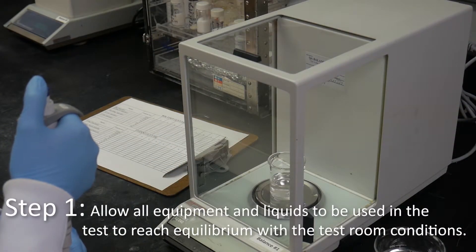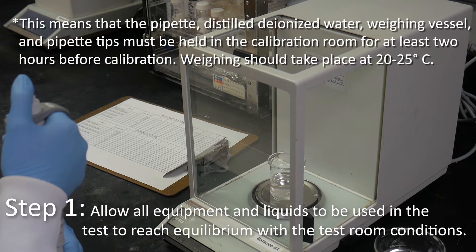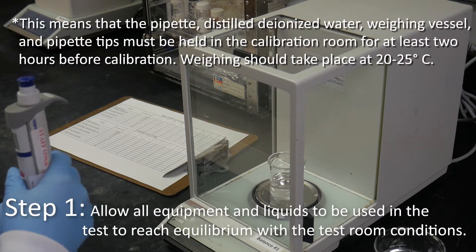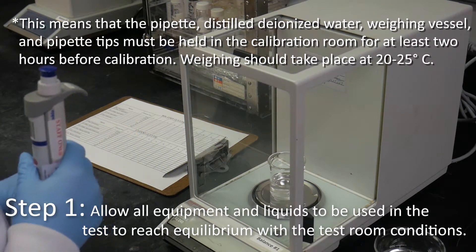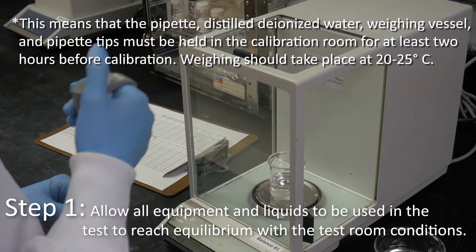Allow all equipment and liquids to be used in the test to reach equilibrium with the test room conditions. This means that the pipette, distilled deionized water, weighing vessel, and pipette tips must be held in the calibration room for at least two hours before calibration. Weighing should take place at 20 to 25 degrees Celsius.